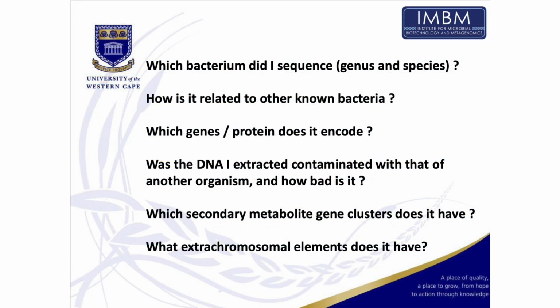All right, so now that I've reassembled my bacterial genome, some other questions pop up. Which bacterium did I sequence? What is the genus and species? How is this related to other bacteria? Or did I find something completely novel? Which genes or proteins does the genome encode? Was the DNA I extracted contaminated with that of another organism? And how bad is it?